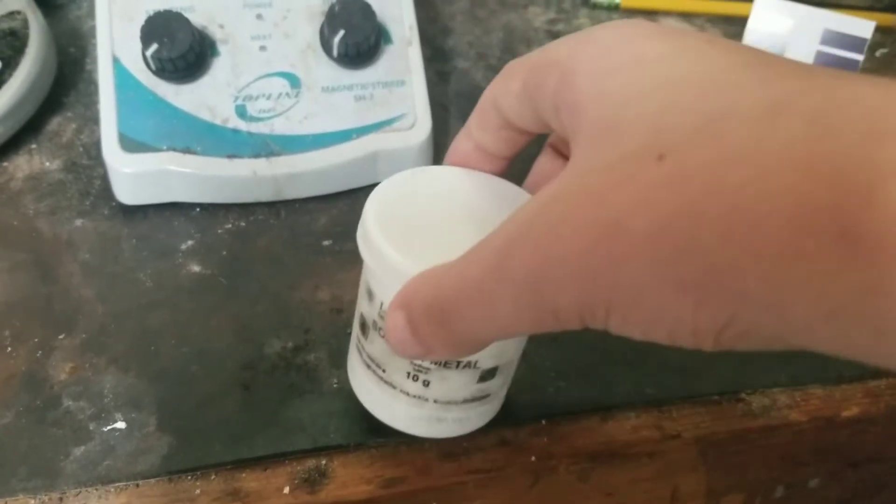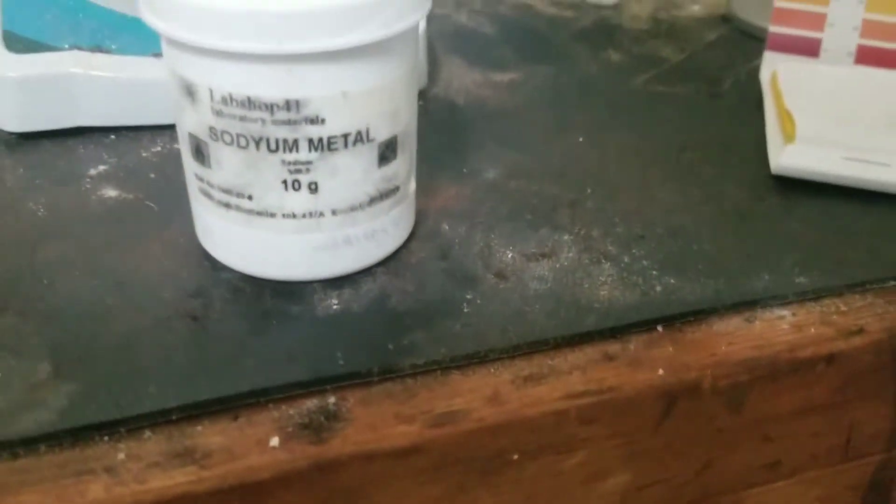You'll probably find someone throwing in a two pound chunk. And I only have — it says 10 grams — but I've used a lot of it.